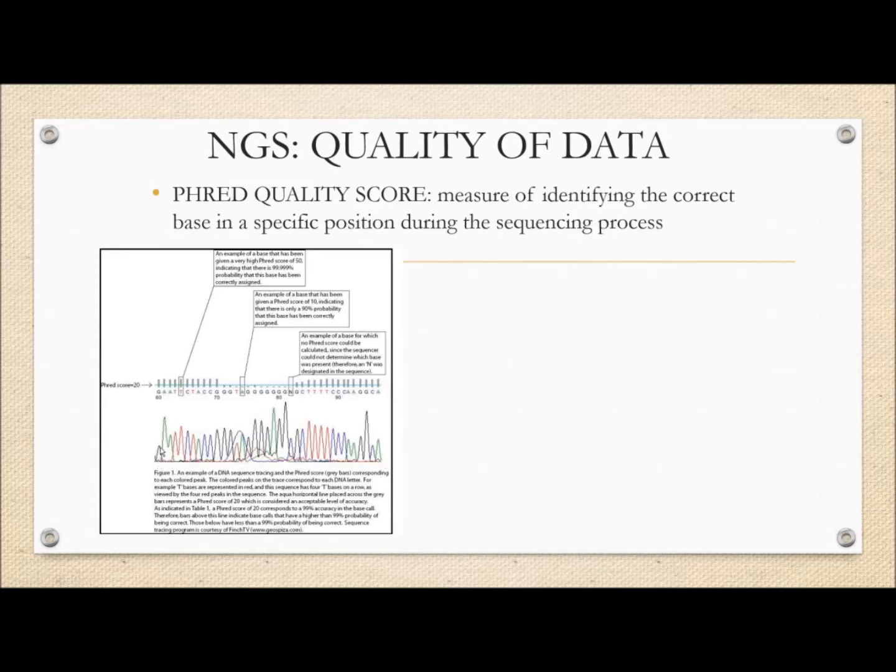As you can see, if it's a high probability, you'll realize that this is green, and the blue, red, and black are virtually not there, right? Again, you see strong probability, strong probability, strong probability, until we come here. Now, this is predicted as a T, and this one is an A, and this is a G. But see, there is an overriding blue graph there, which means either of these could be a C. Okay, so these could be C's.